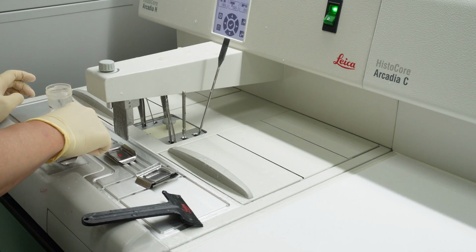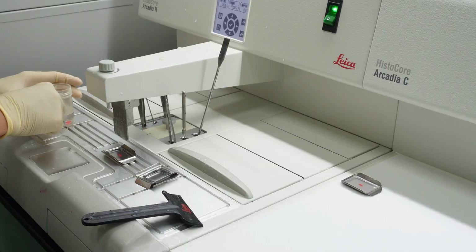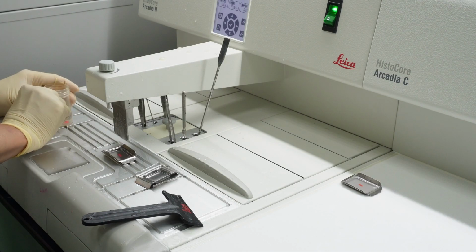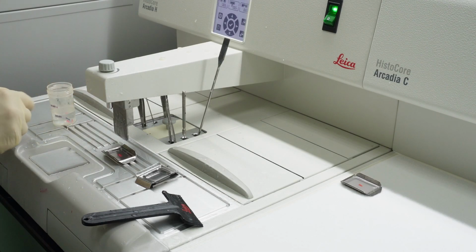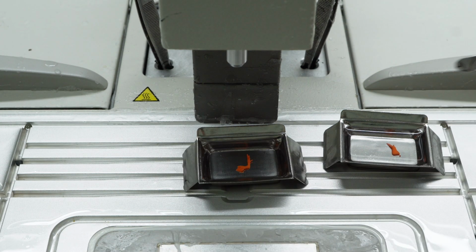How do you make the block? You take small metal molds, fill them with fresh melted paraffin, and then place the infiltrated embryo inside. And here's a really critical part: orientation. Ah, how you position the embryo in the wax. Exactly. You have to think ahead.